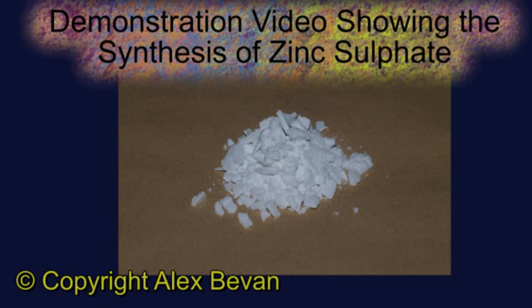This is a demonstration video showing the chemical synthesis of zinc sulfate by the chemical reaction between metallic zinc and sulfuric acid.